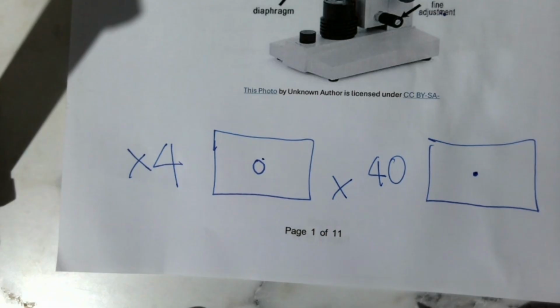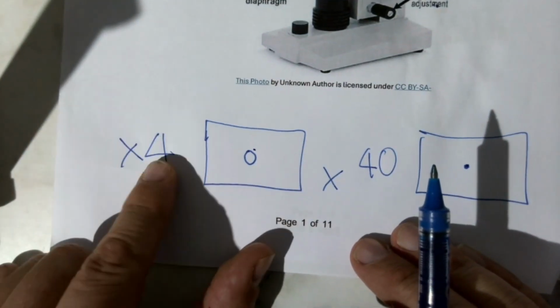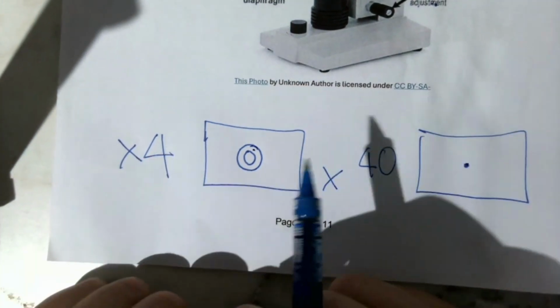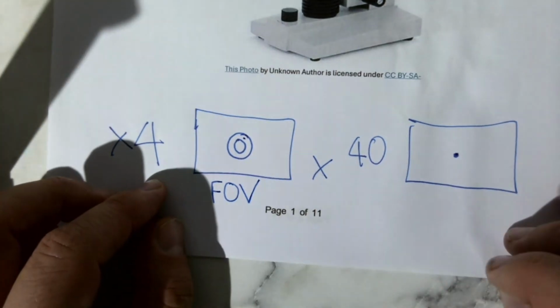this is not to scale, by the way. When you look through the eyepiece lens and through the objective lens, by using a smaller magnification of a total of 40, you're able to find where the specimen is, because the specimen is much larger, so it has what we call a wider field of view.